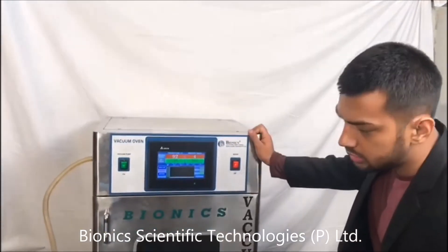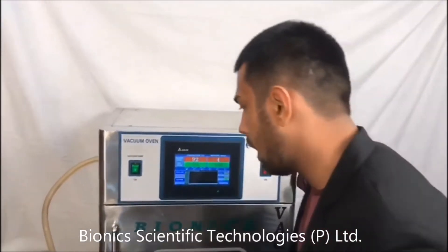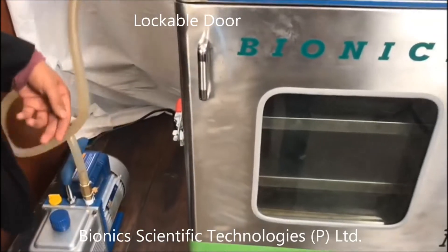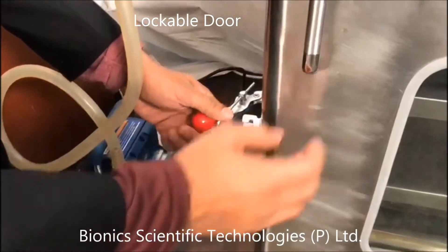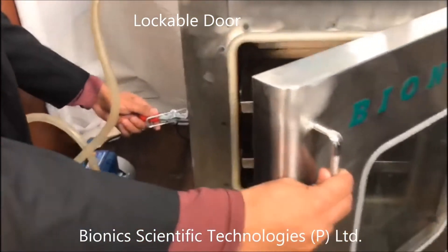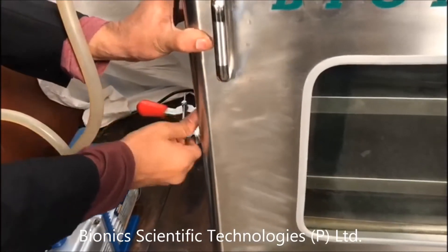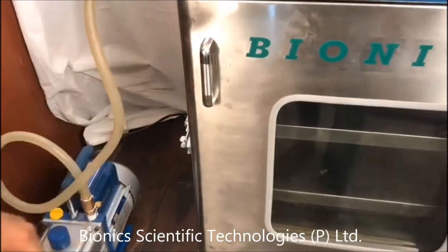Now I'll show you the things which are present inside this machine. First of all, I'll show you how this machine works with this lockable door — you can lock the door. Now it is unlocked, and now it is locked like this.